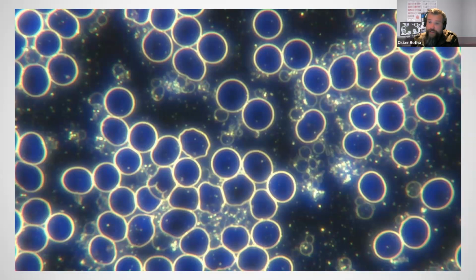And then work with the next thing. So if you have a good system and you obviously have been trained properly, then live blood analysis makes things a lot easier. But if you're not able to see everything, then it doesn't, and it becomes actually more difficult.